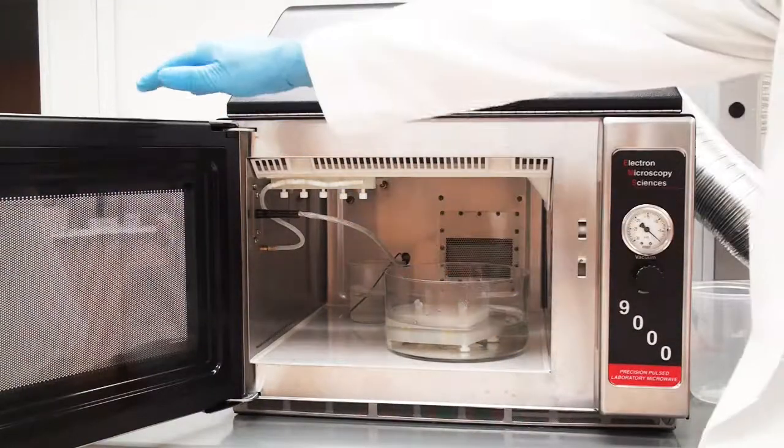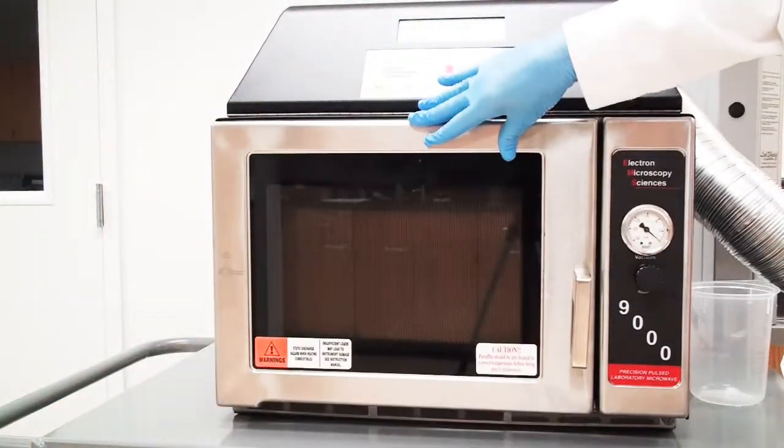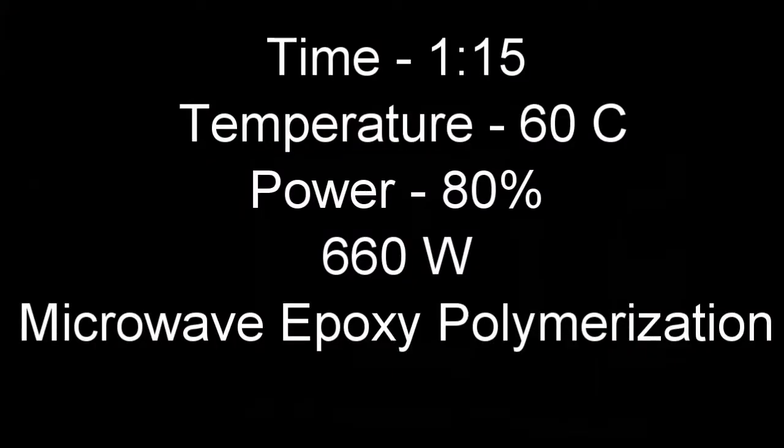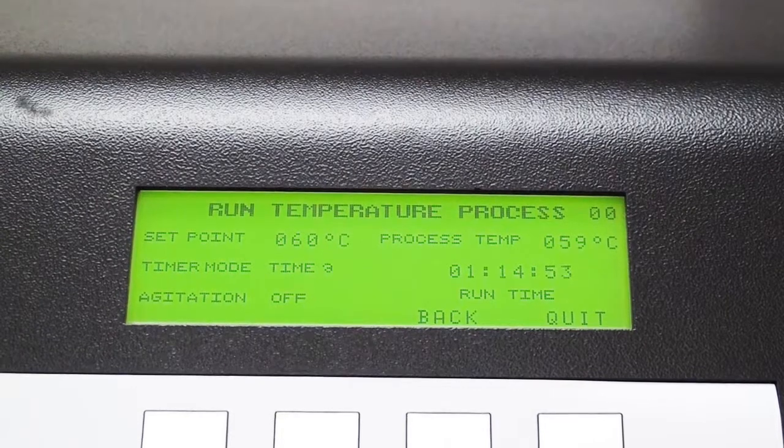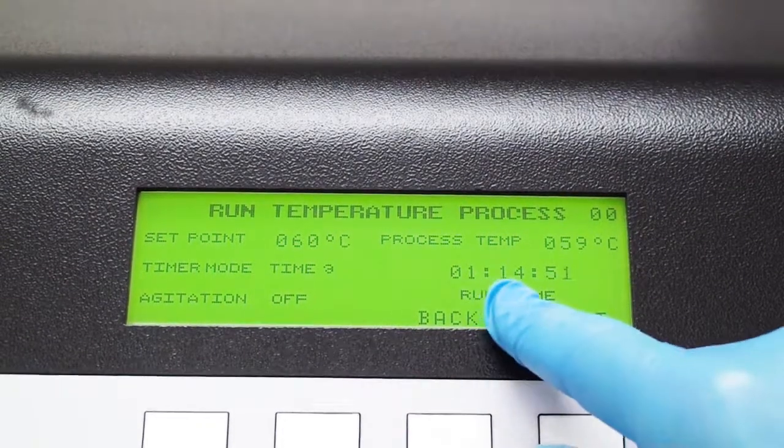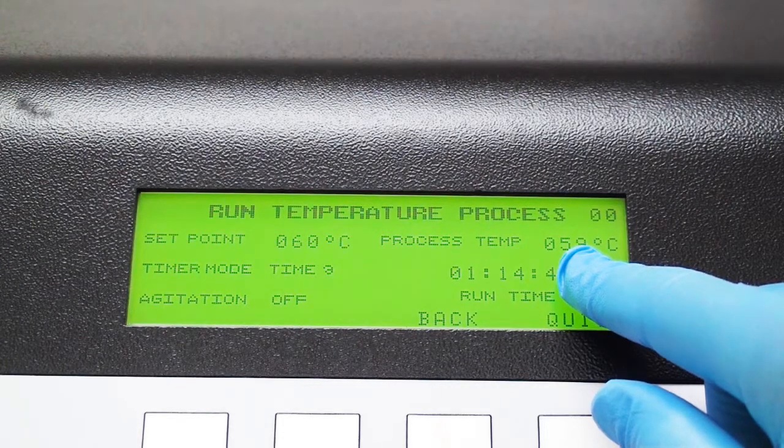You can always check and make sure there's enough water in there to immerse your samples. So we're doing 1 hour, 15 minutes, 80% power, 60 degrees C. It comes out to be 660 watts. We're going to check on that, and 1 hour and 15 minutes is counting down now, at 60 degrees C.